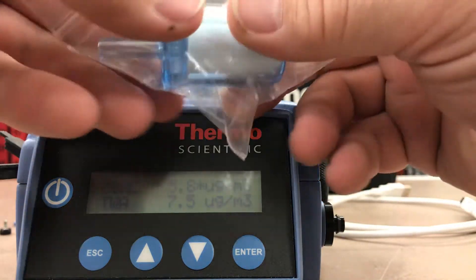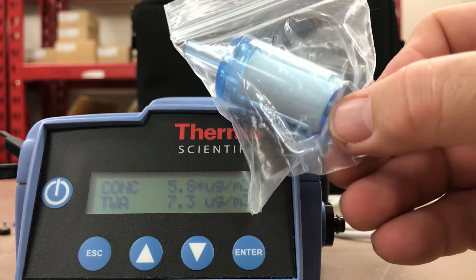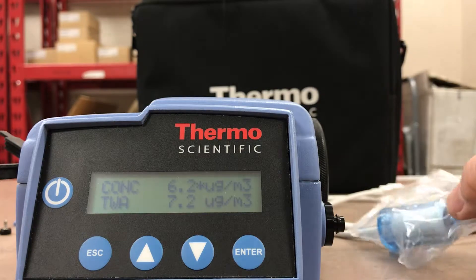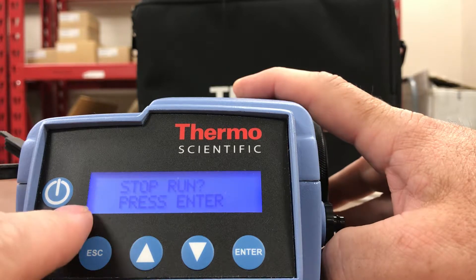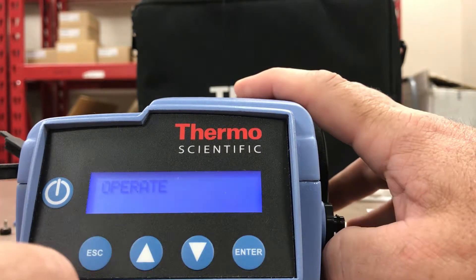One other thing they give you is a simple zeroing accessory. When zeroing the instrument through the menu, you can connect this to the sample input just to do a particulate zero reading. If you want to stop the sample, just simply hit Escape, it'll say Stop Run, press Enter, and we're back to Operate.